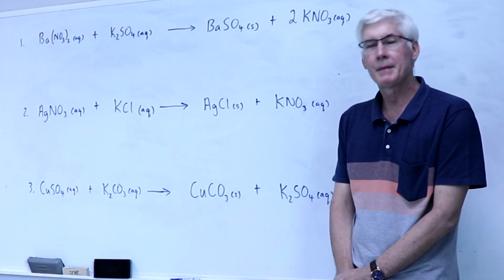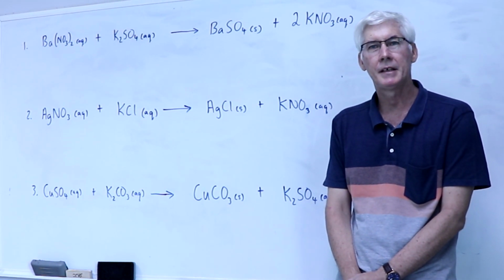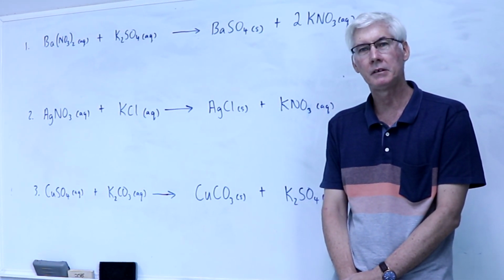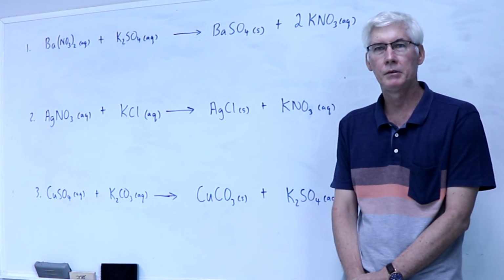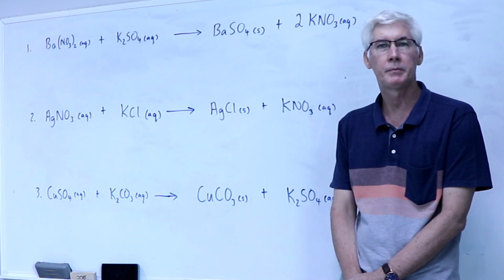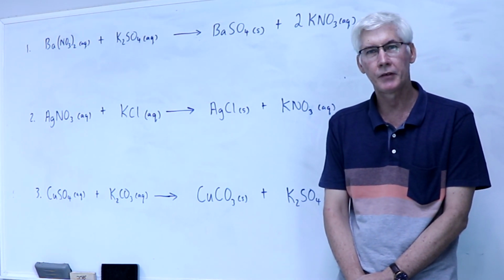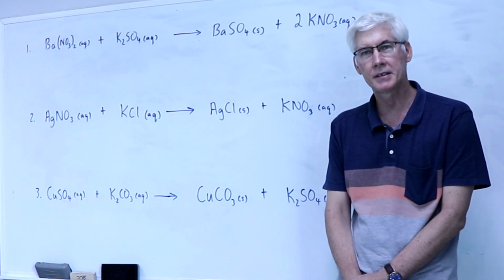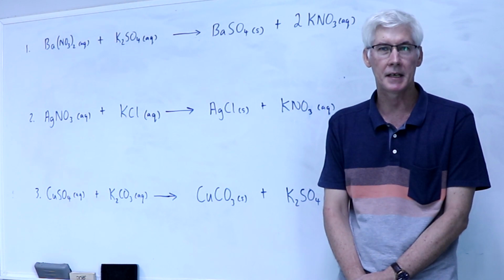Today's brief demonstration is basically to help you understand a little bit more about how to make an insoluble salt and what a precipitation reaction is. I'm going to do a couple of very simple precipitation reactions and describe what's happening in those reactions, so that you have a better understanding of what you need to be doing when you get those questions in your textbook.